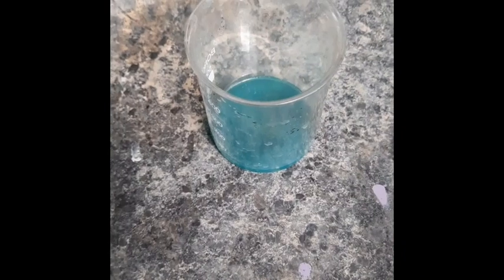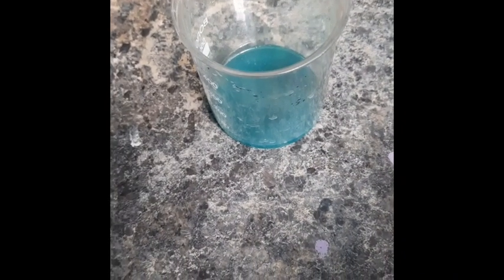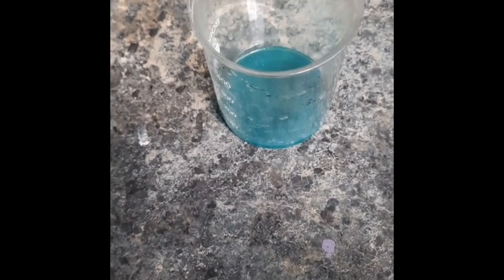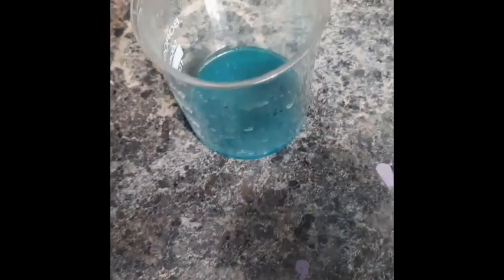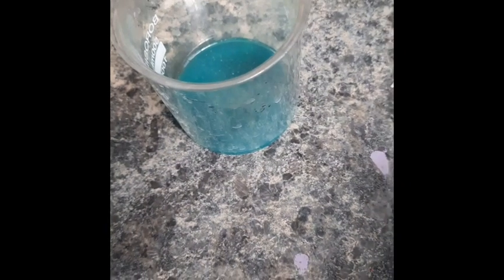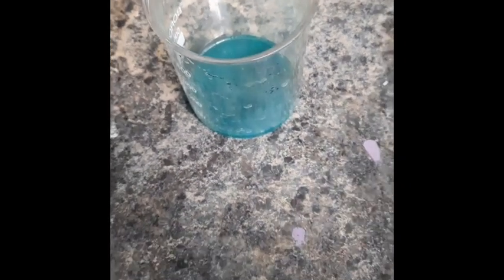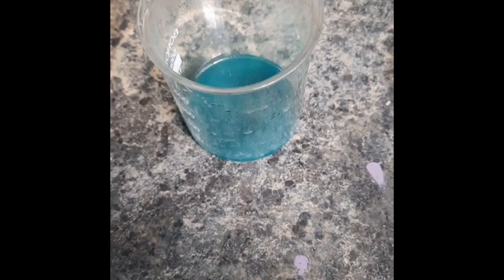After cooling, you have to add 10 ml concentrated H2SO4 in this beaker. Now we have to wait till it cools. After adding this H2SO4, you have to heat till white fumes are completely evolved, and then you have to dilute it.